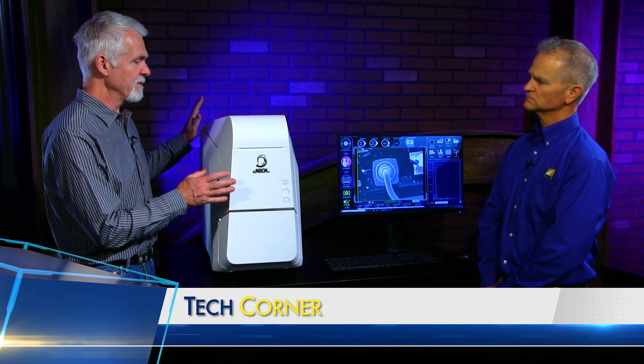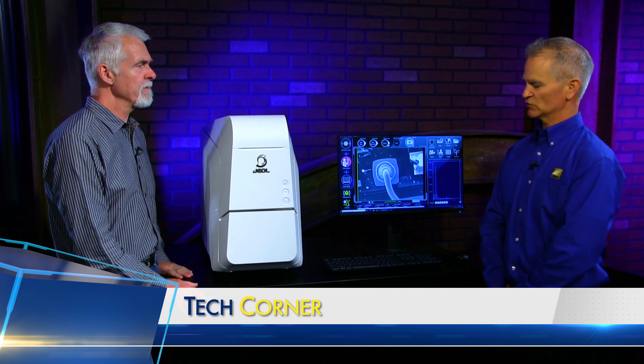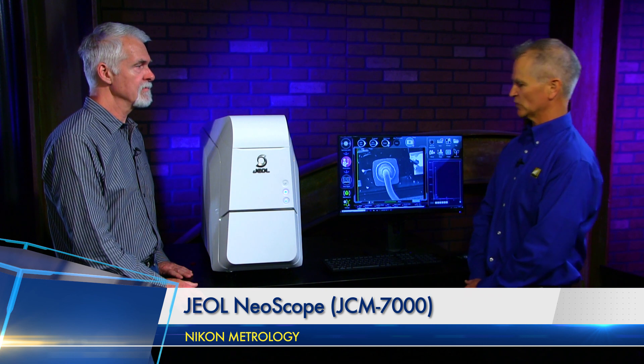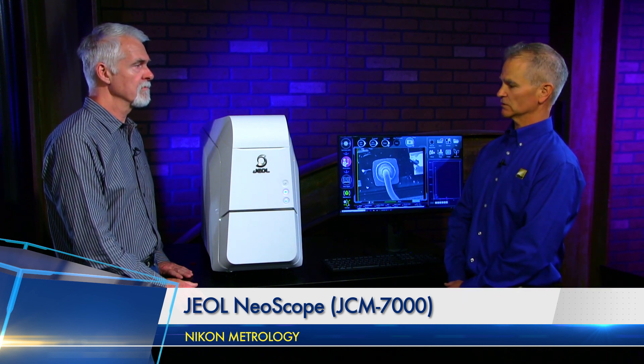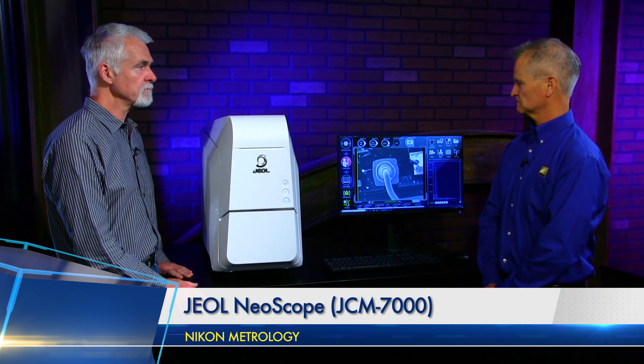What makes this particular unit stand out? Any special features? The new six-segment backscatter detector on here, and we have two different vacuum modes for imaging non-conductive samples.